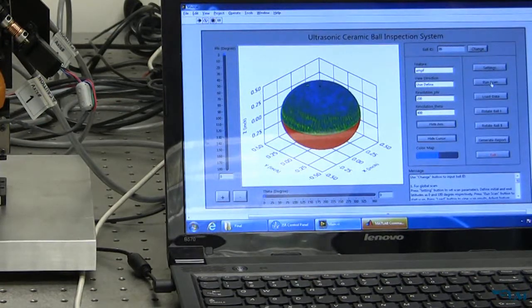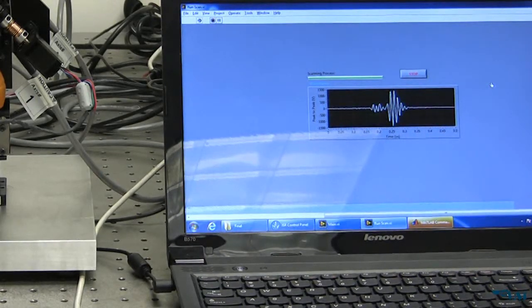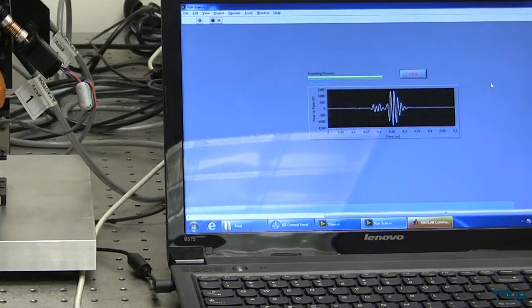A pop-out window will show the scan process and real-time waveforms. There are two waveform packets in the A-scan signal. The first one corresponds to the direct reflection signal from the ball surface, and the later one is the surface acoustic wave.